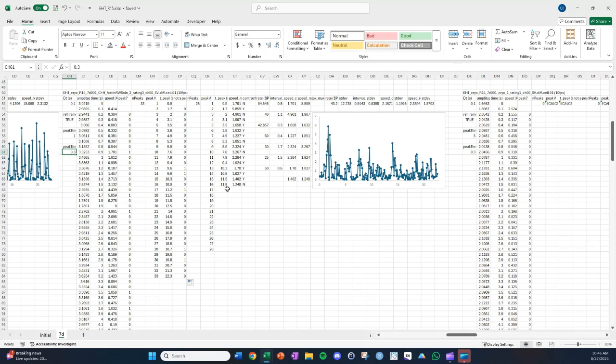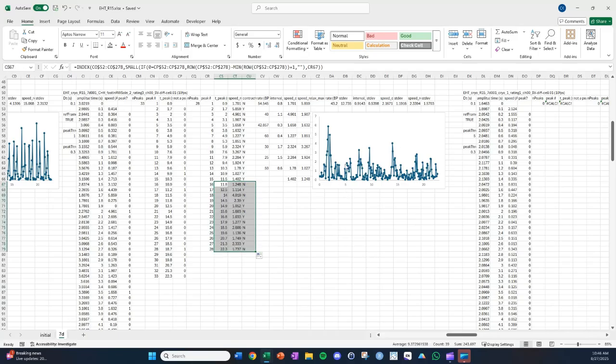You can see though that it's not giving great results here. And this is even without going into the graph too much. You can see that because of this column. I guess before I go into that though, I'll just say that it identified 5 time points that did not pass this check. So it's only going to list 28 peaks, and it's going to give this time and, importantly, the speed for those peaks.